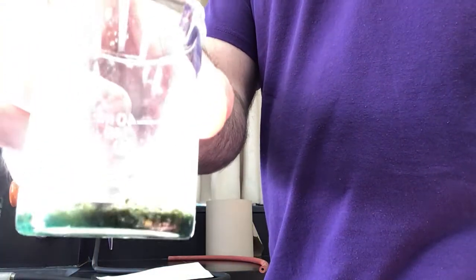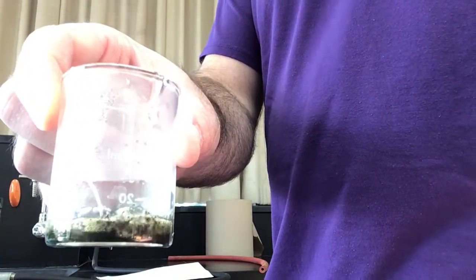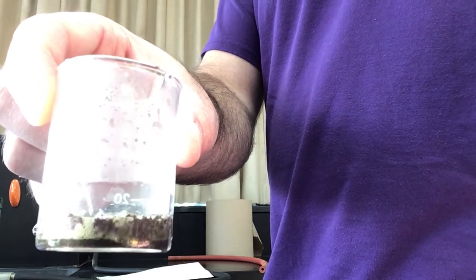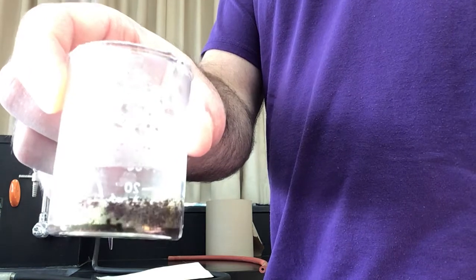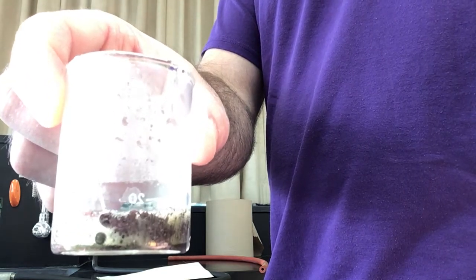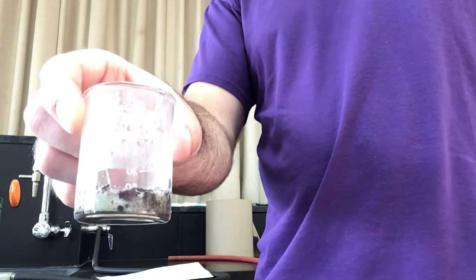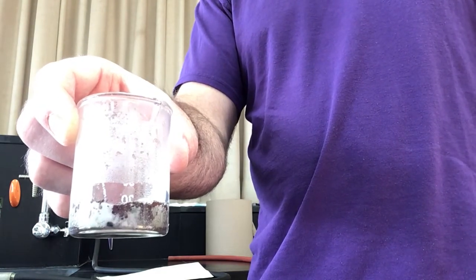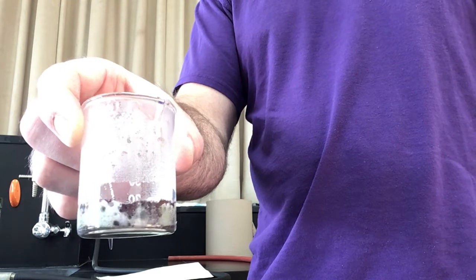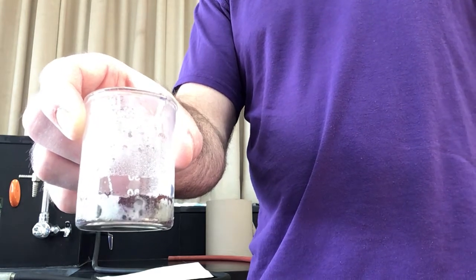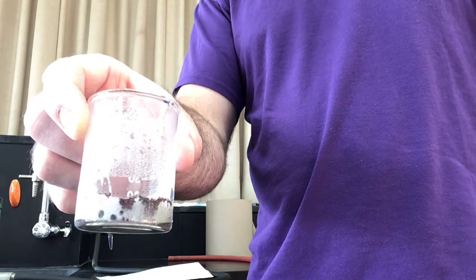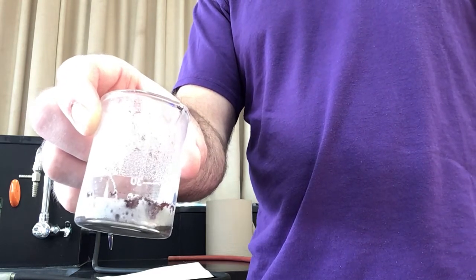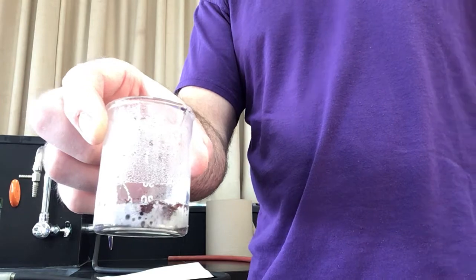You can see it's reacting super vigorously. When the reaction stops, a couple ways that we're going to know: one, we're not going to see this vigorous reaction that we see happening here. Also, the solution that was green should be colorless then. We'll let this continue to react and then we're going to filter off the copper that is forming as a solid.